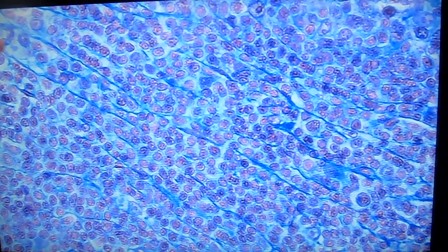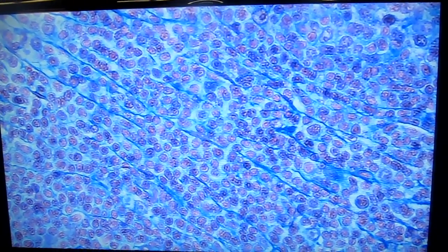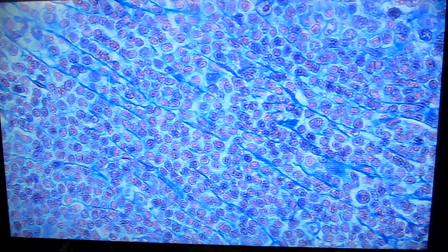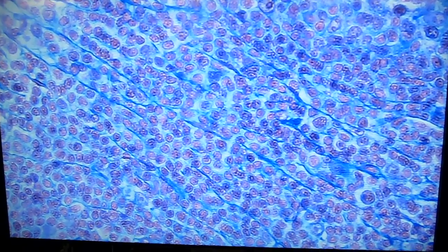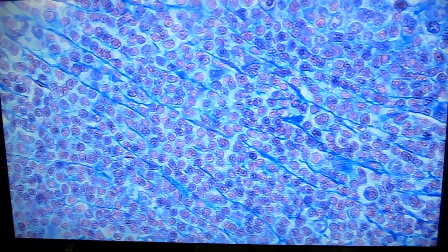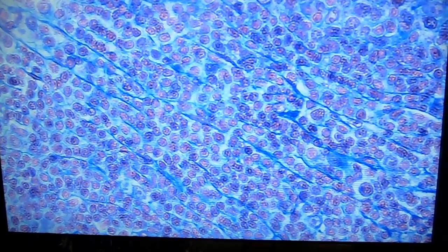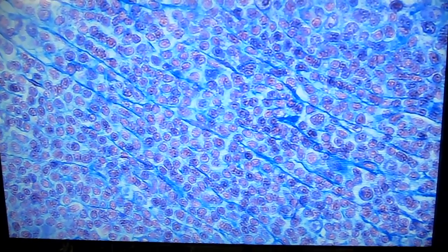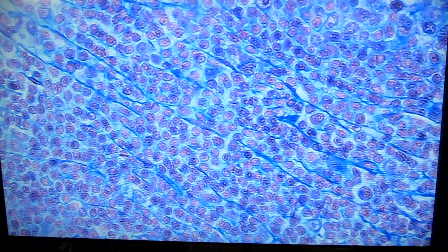And the cells that you see here, many of them are components of the immune system. So the reticular fibers are giving them a place to hang out here in this lymph node and a place to attach to, so as fluid is going by, they can investigate what's in there and activate the immune system as appropriate. Okay, so again, this is our third loose connective tissue. This is the most cellular of all of the connective tissues, and this is reticular connective tissue.